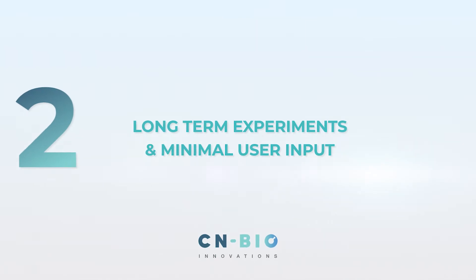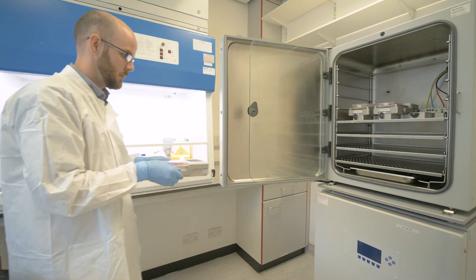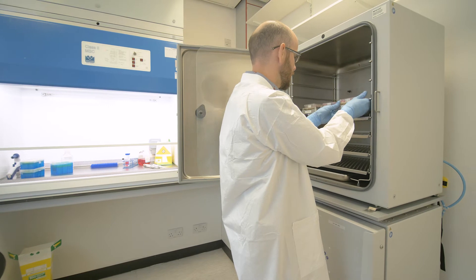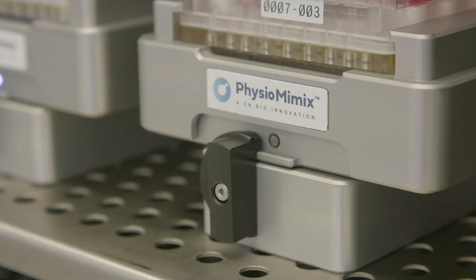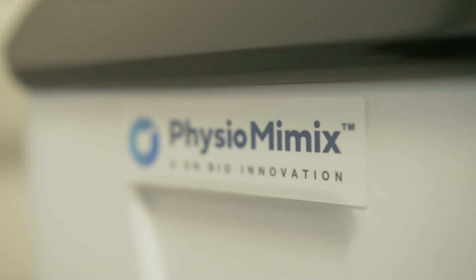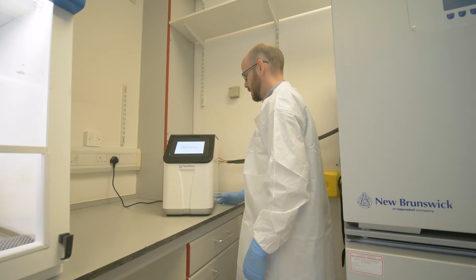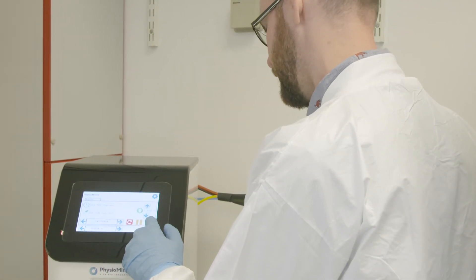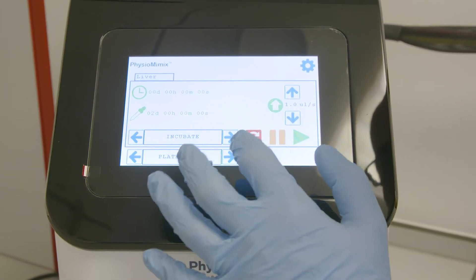Step 2: Long-Term Experiments with Minimal User Input. The PMXOOC is compatible with standard cell culture incubators. Transfer the MPS driver and docked MPS plate from the biological safety cabinet to a cell culture incubator and secure the MPS onto the docking station. The intuitive software of the PMXOOC controller automates control over the microfluidics, enabling long-term experiments with minimal user input. The microfluidics perfuse cell culture medium through or across tissue structures, providing oxygen and nutrient diffusion, as well as biomechanical stimuli.